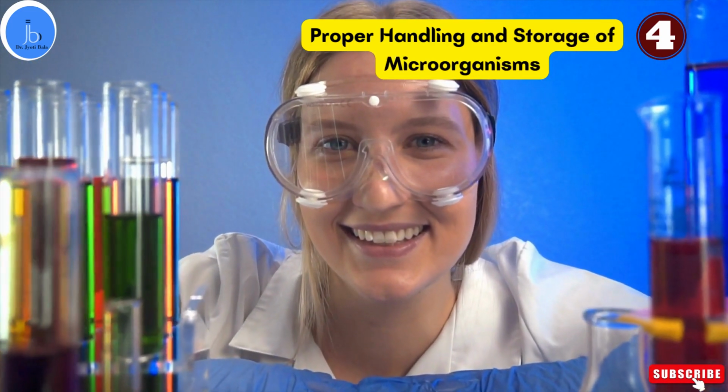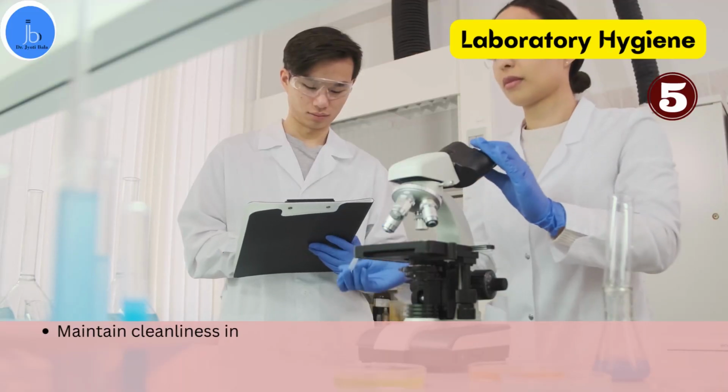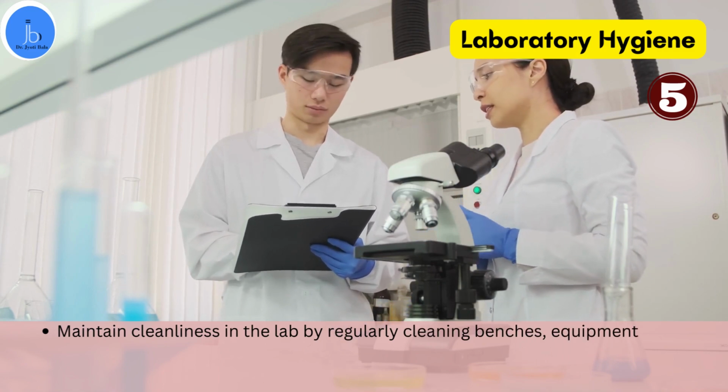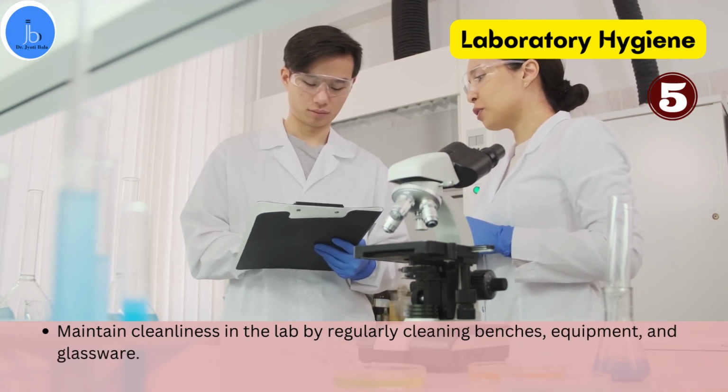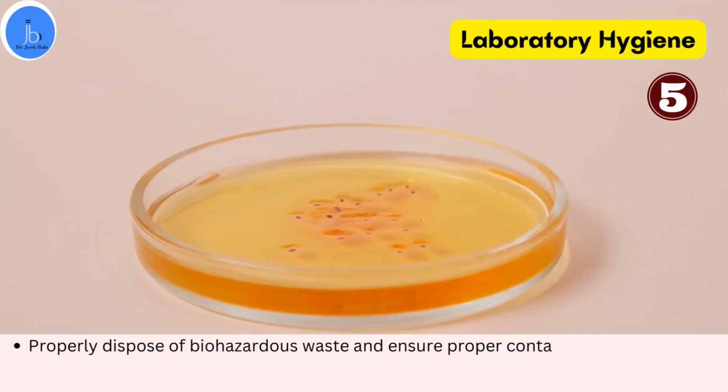The fifth is laboratory hygiene. Maintaining a clean and hygienic lab environment is essential. Regularly clean benches, equipment, and glassware to prevent contamination. Properly dispose of biohazardous waste and ensure spills are contained and cleaned up promptly.